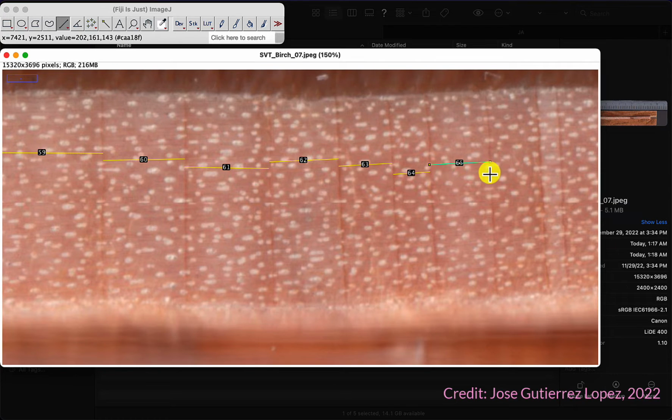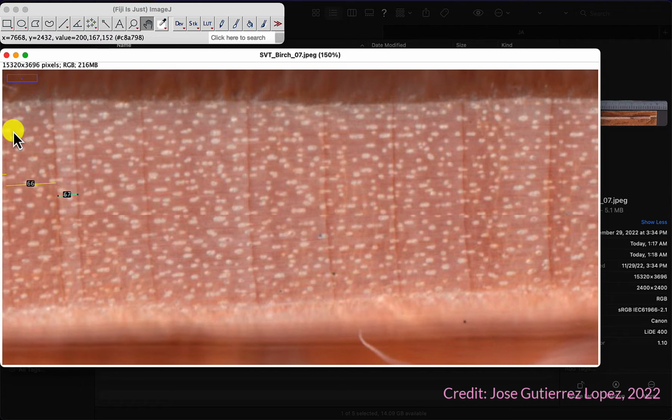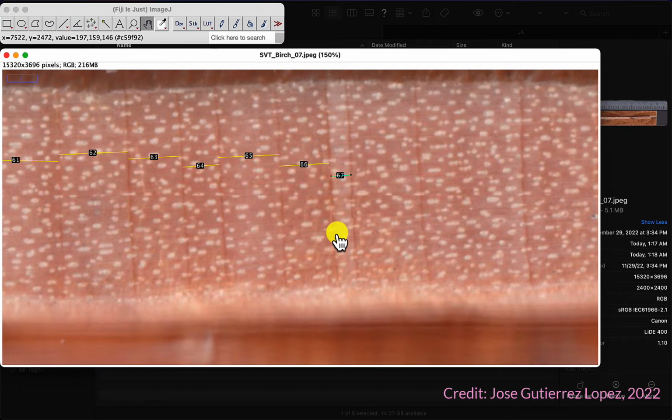I mean, compared to some trees I used to work with, eucalyptus in Argentina, and those grow so fast. Almost there. Oh, that's a unique ring. Look. Huh, super cool. Something happened on that year. Yeah, I would say it's highly unlikely that that one is a false ring.